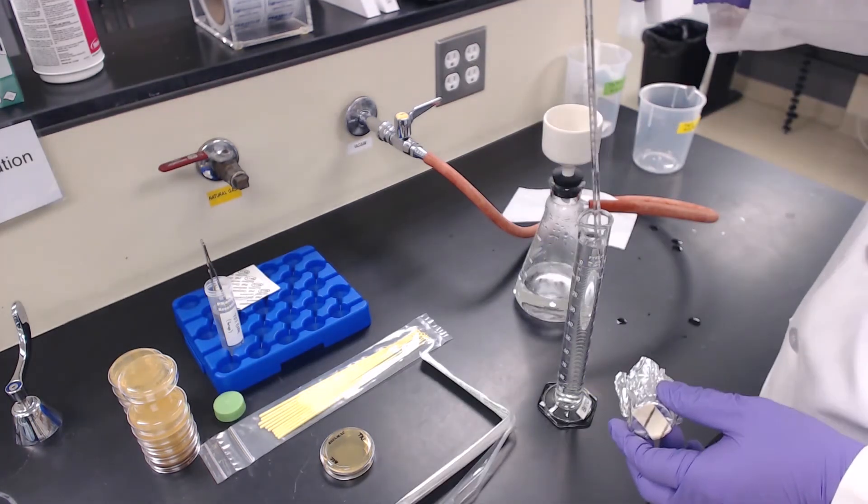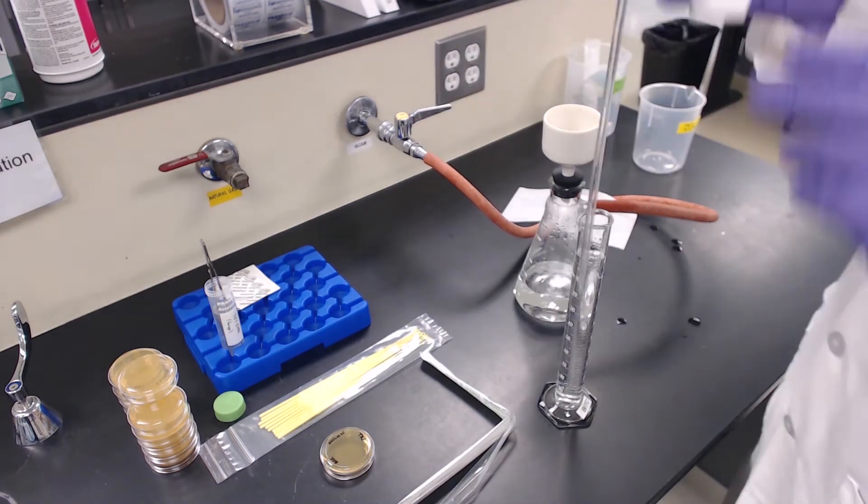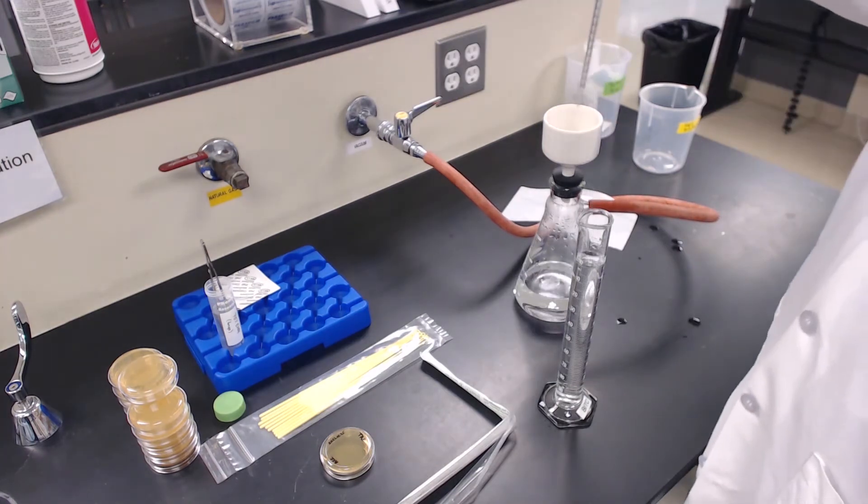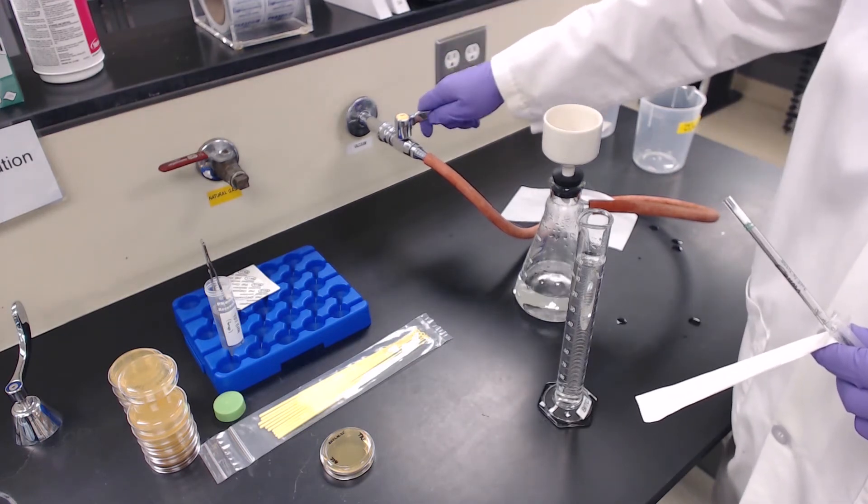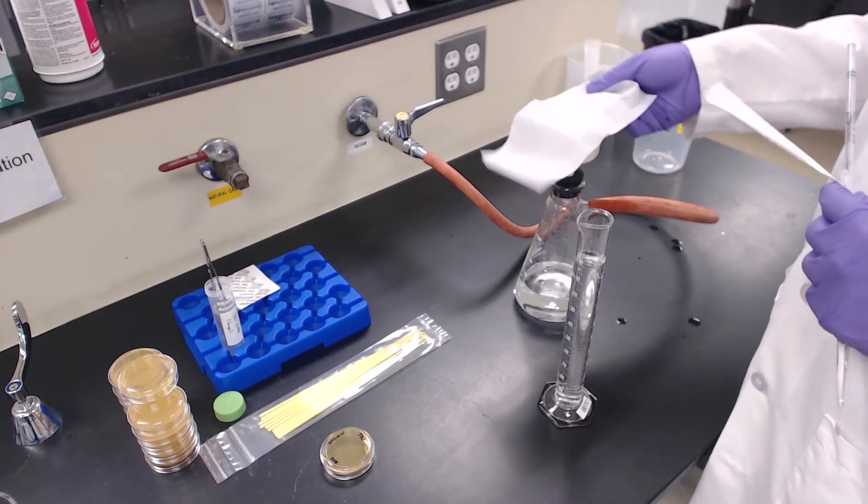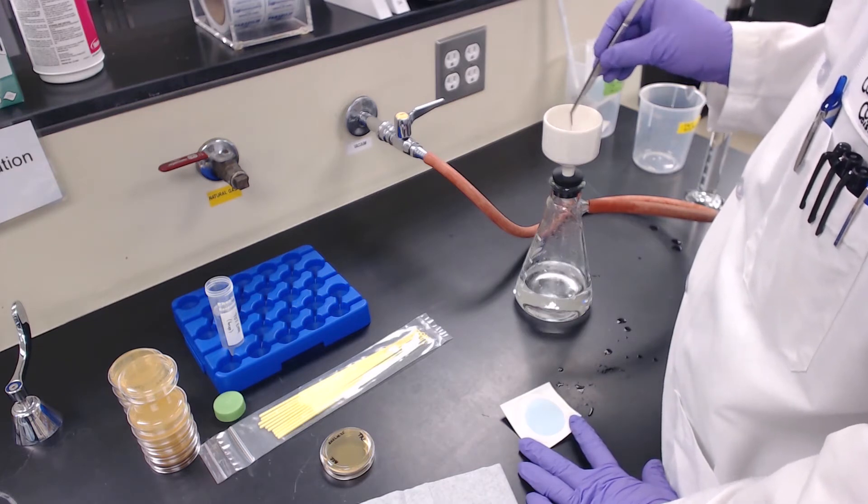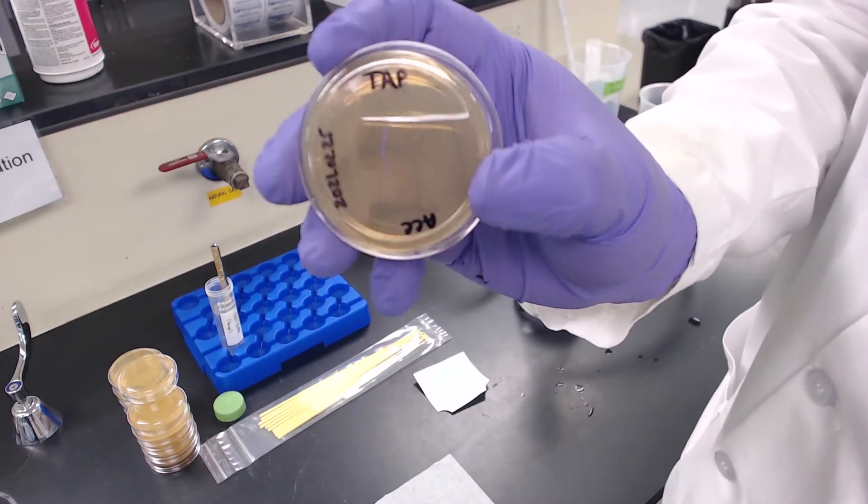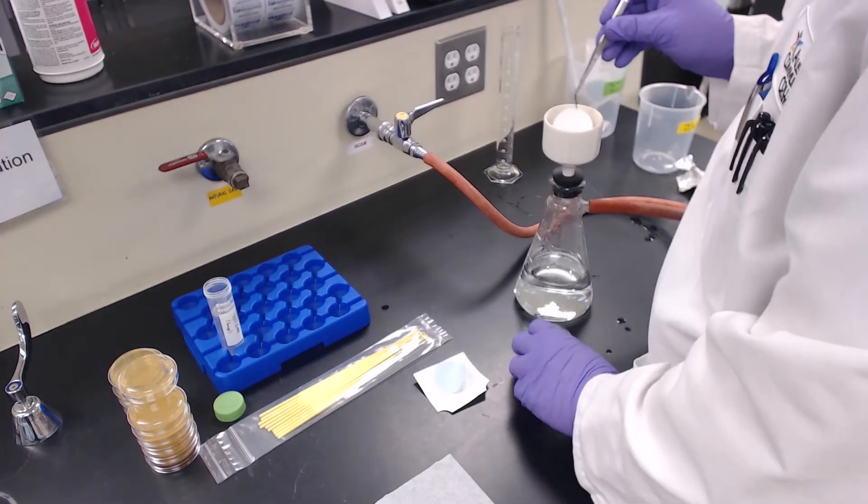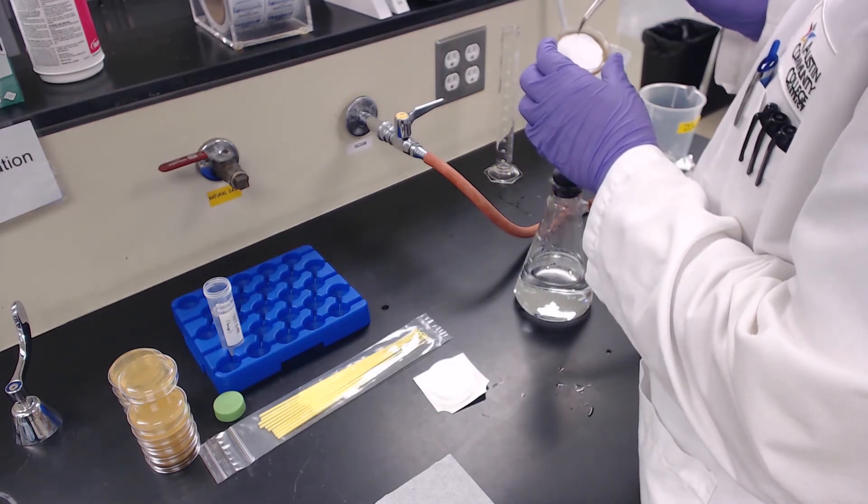Take your third water sample and as before, rinse the funnel with some of the water before placing in a new filter paper. Place a gridded filter paper in the rinsed funnel. Filter through 100 milliliters of your third water sample. Transfer the filter paper to the corresponding petri dish.